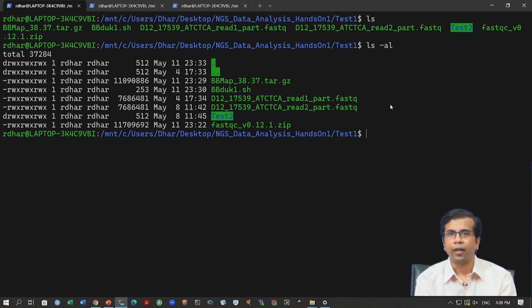As we have discussed, these FastQ files, the data generated from the Illumina platform, are actually huge in size, really big, because you have millions of reads in there. If you want to do all these analyses with that kind of data set, we will not be able to complete this hands-on within a reasonable period of time, because all the steps will take a long time to complete.